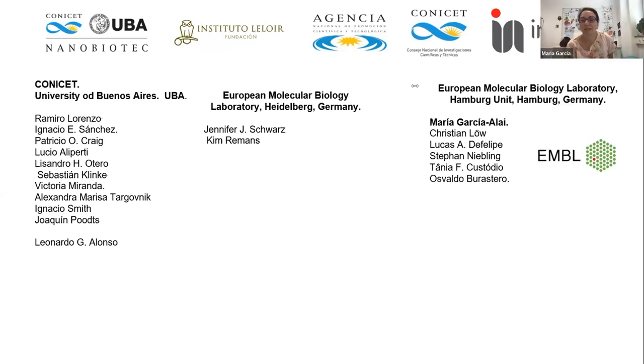And it says pH will increase the deamidation. Doesn't this affect your result? Yes, of course. The increase in pH, you can try any pH you want, but anyway, we try to restrict the pH to physiological pH, like neutral or slightly basic pH.